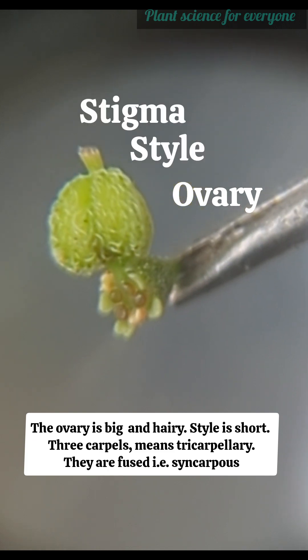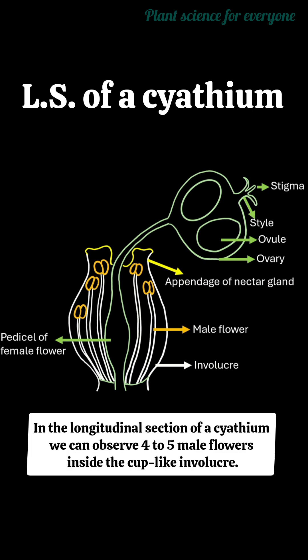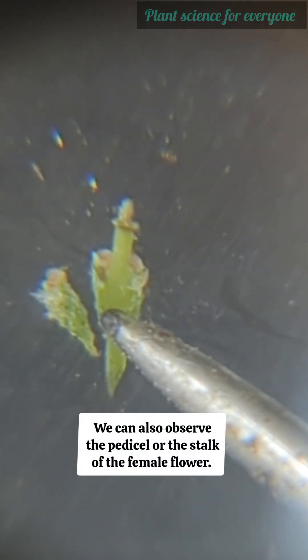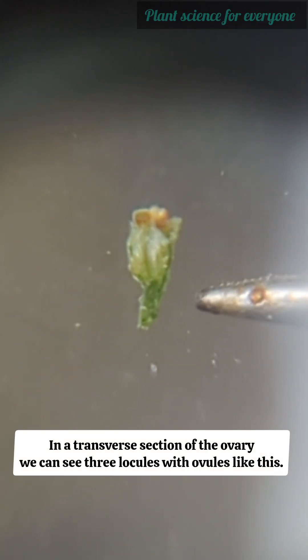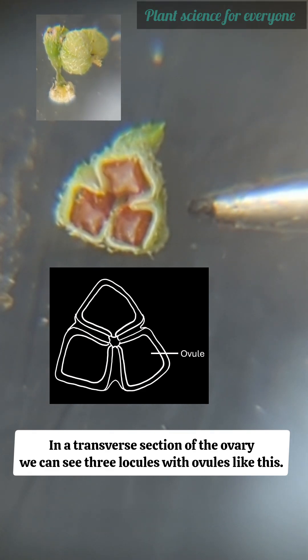The ovary is big and hairy, the style is short, and three carpels make it tricarpellary. They are fused, meaning it is syncarpous. In the longitudinal section of a cyathium, we can observe four to five male flowers inside the cup-like involucre. We can also observe the pedicel or stalk of the female flower, and the anthers are reddish.